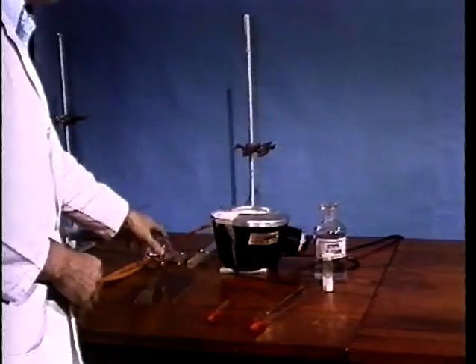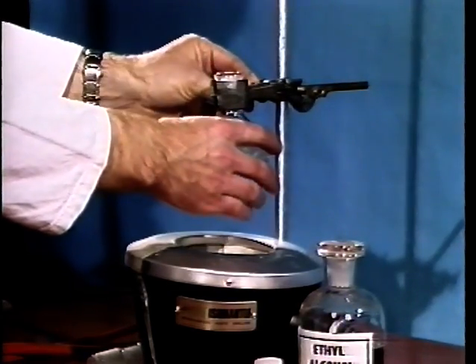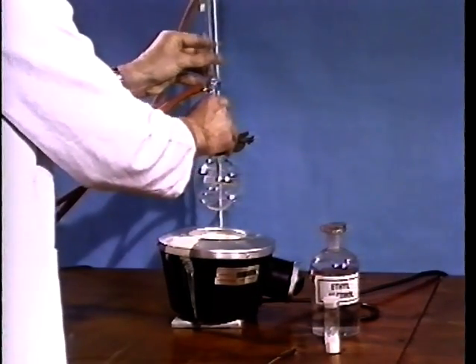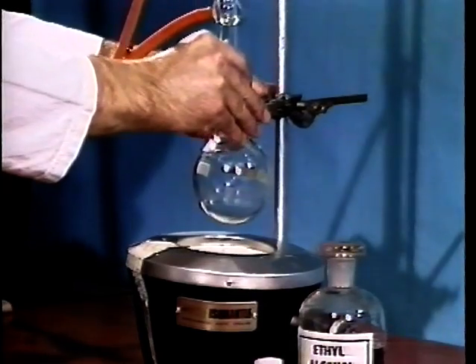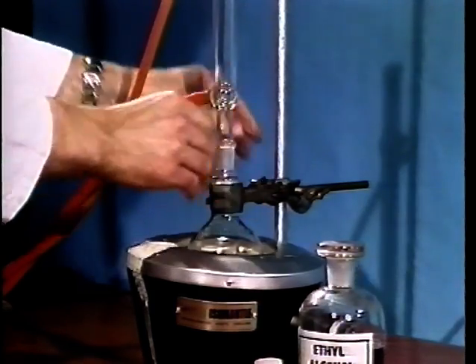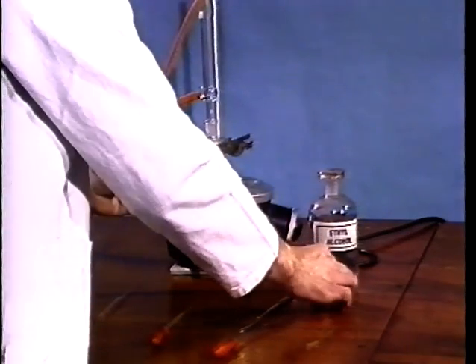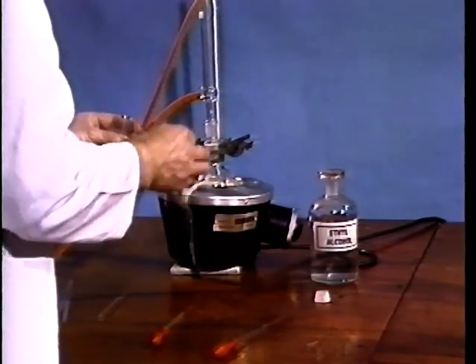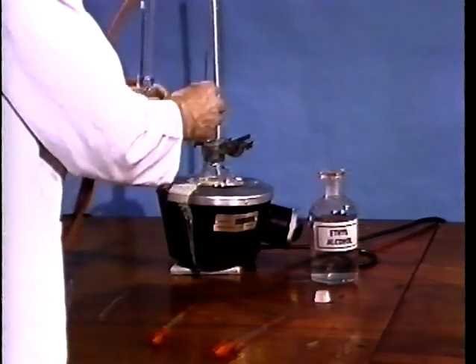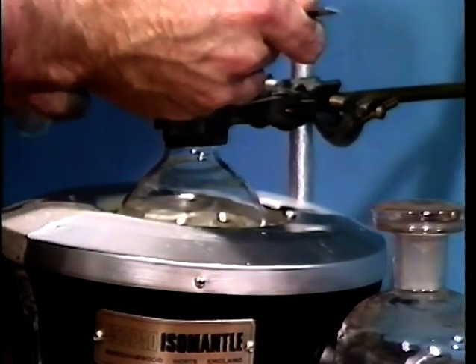In order to recrystallize the bulk of your sample, set up the apparatus as follows. Place a 250 milliliter round bottom flask in a clamp and insert into the neck a condenser, running a gentle stream of water through that condenser. Then place the bulk of your sample into the flask.